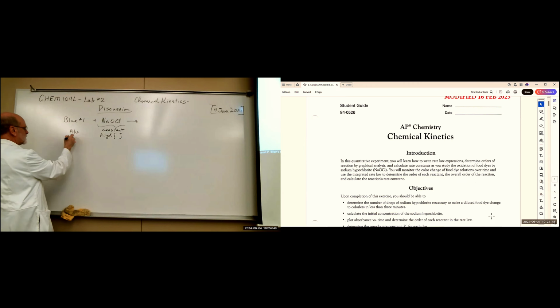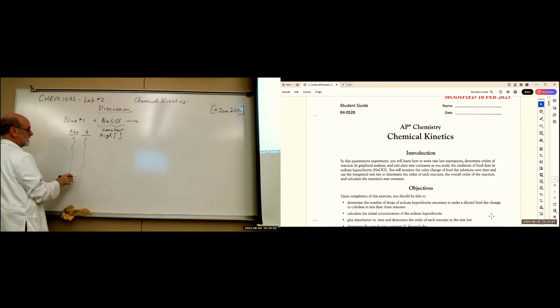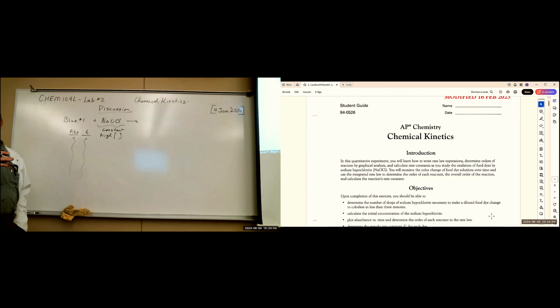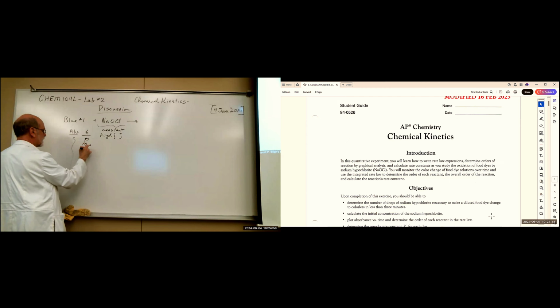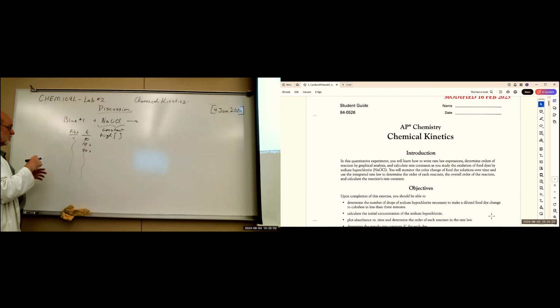So we get absorbance against time, right? We get these values here. Every 10 seconds, okay. So you go from 0 and you get 10 seconds and 20 seconds. And you watch that until the value of absorbance gets so low that it's not worth watching anymore. And you take that data and you do things to it.